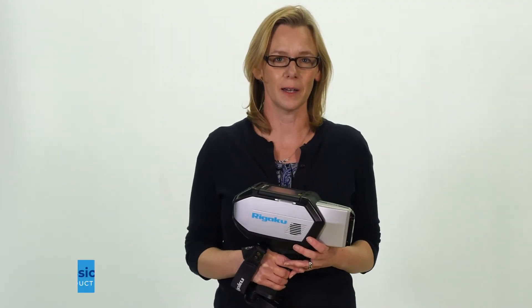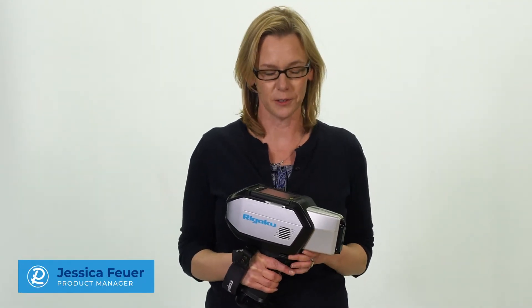Hello, I'm Jessica Fior, a product manager at Regaku, here to introduce to you the KT500 LIBS metal analyzer.